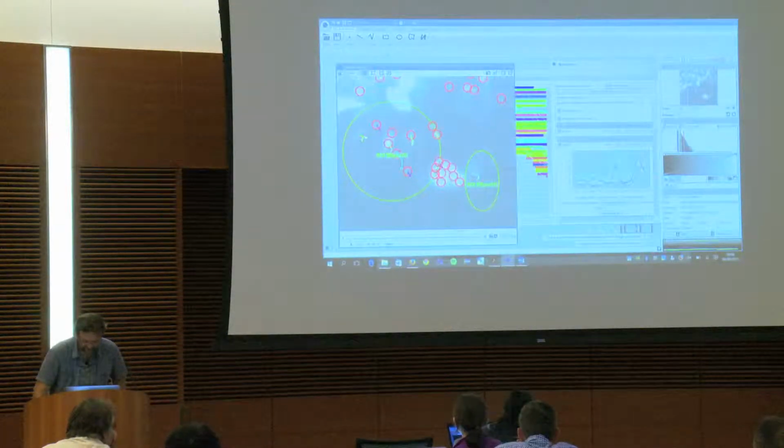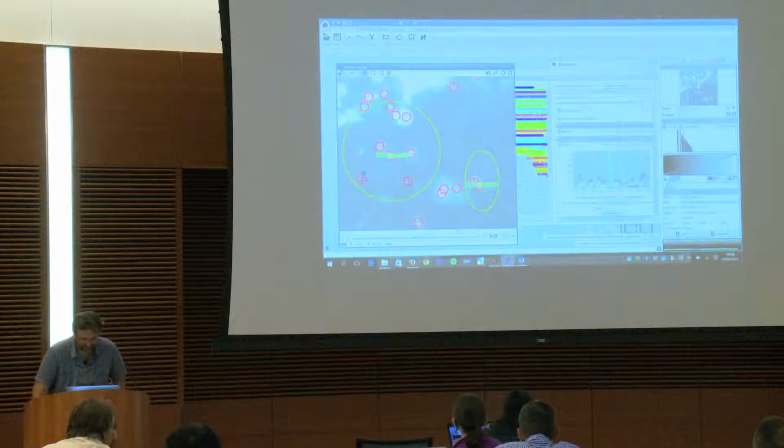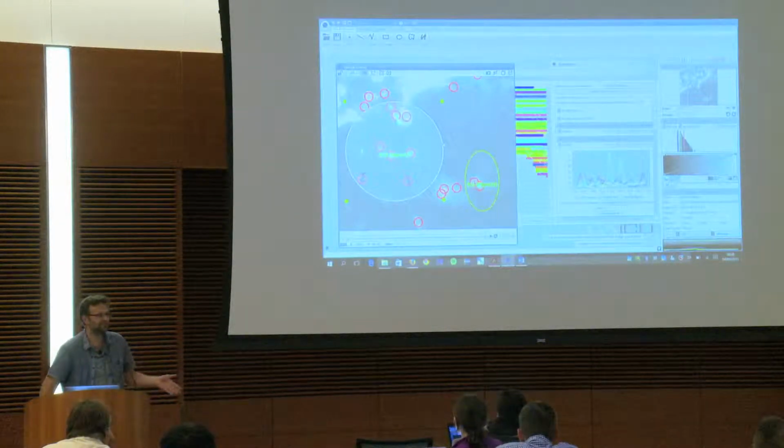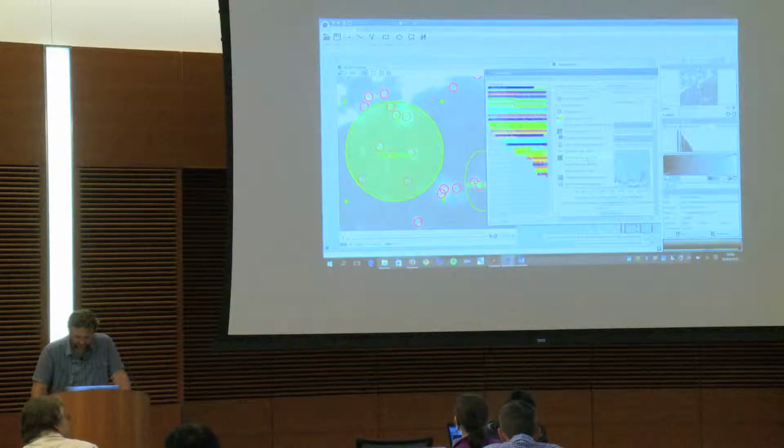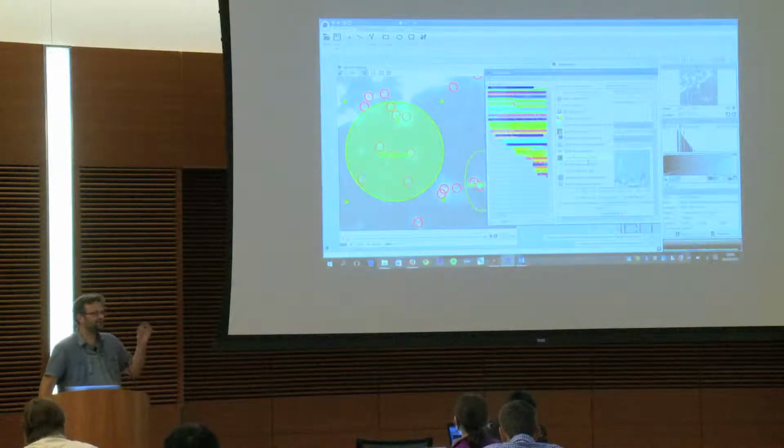And if I pause my system and I go here, and if I move my ROI, you see that the thing is going to be completely interactive. So it's not the plugin that has to deal with it, it's just that we call it when we need to reprocess the data.